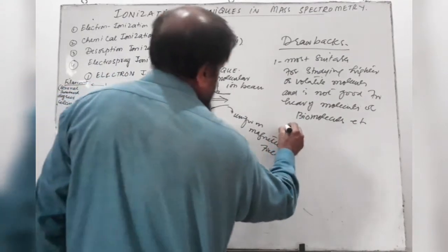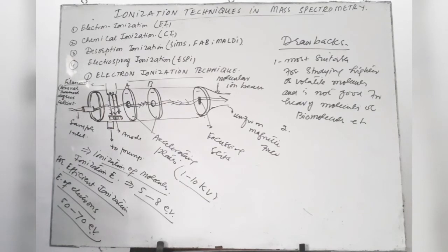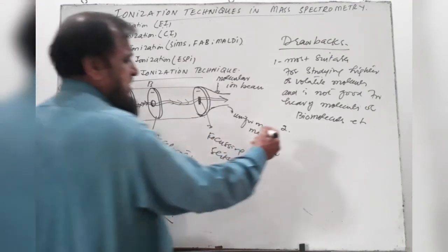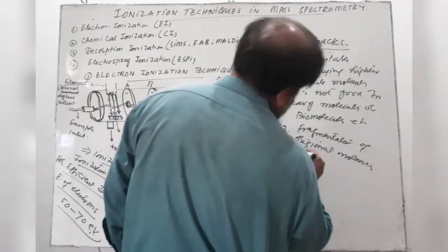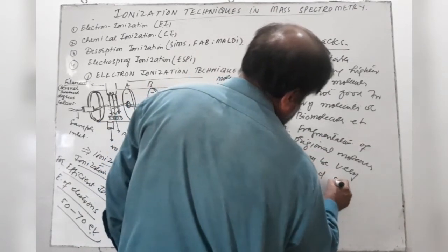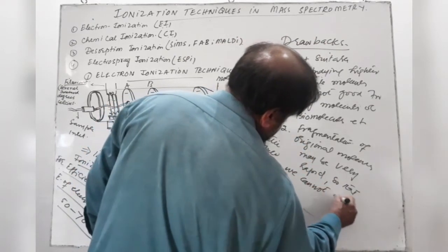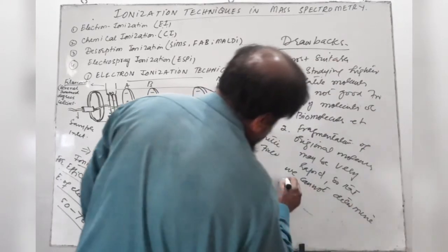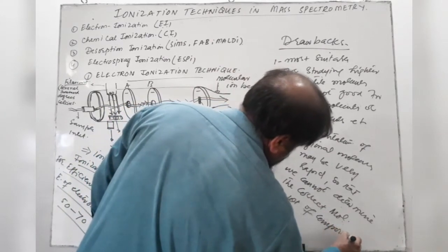And secondly, the molecules may undergo rapid fragmentation, so rapid that we cannot determine the correct molecular weight of compounds with precision.